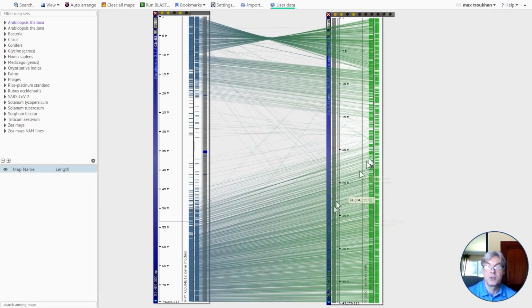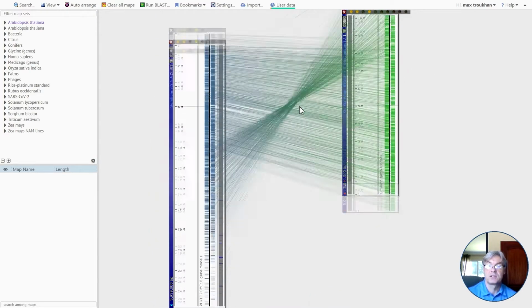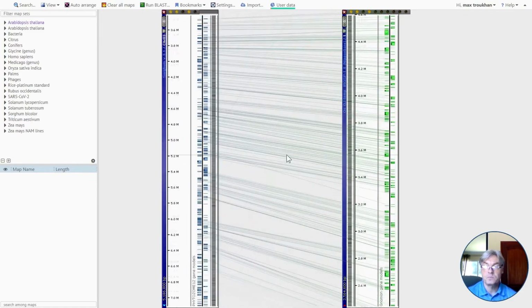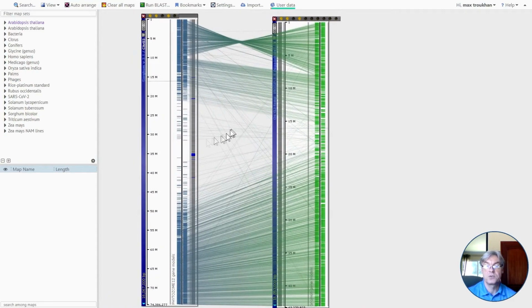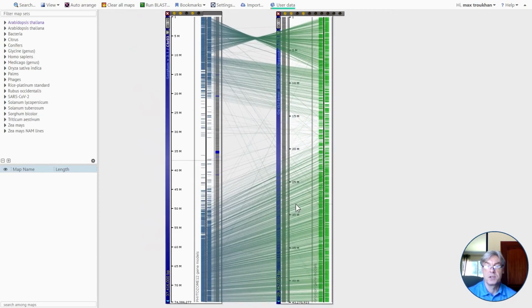So you will see some rearrangements, translocations and inversions. For example, here you can click invert plate and you will just sort of untie this knot around this, so you can study it when everything is collinear. And then we'll put it back like this. And okay, so you can add other genomes here to the picture, and then we'll study the evolution and the history of rearrangements.